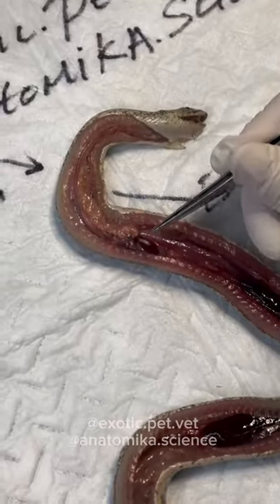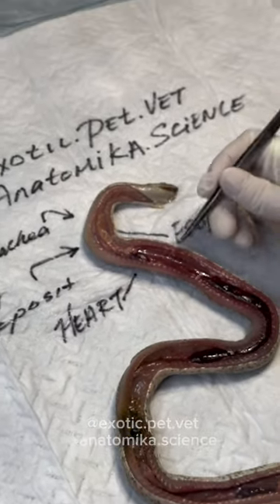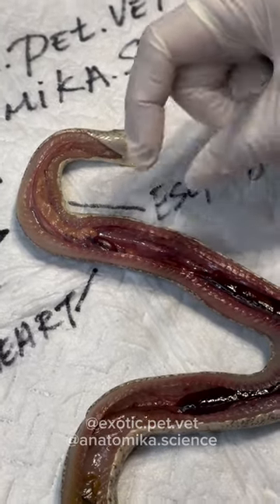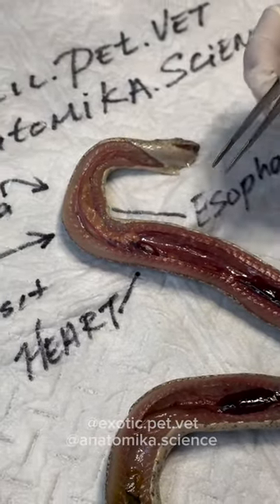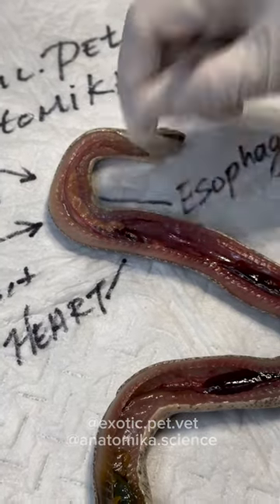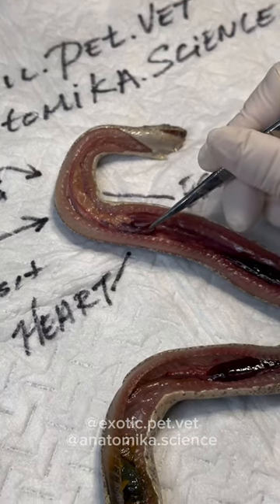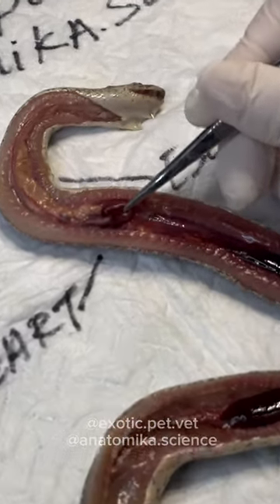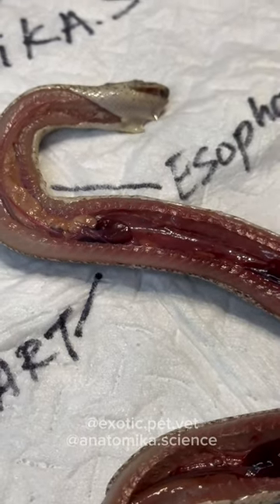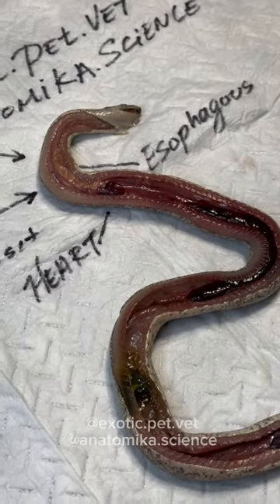Moving on — the heart is extraordinarily tiny. This is a third of the size I would expect in a snake her size. For a snake her size, I would expect the heart to be at least the size of a dime. It's like the Grinch — the heart shrunk three sizes. The heart in this girl is very, very small and we don't know why.